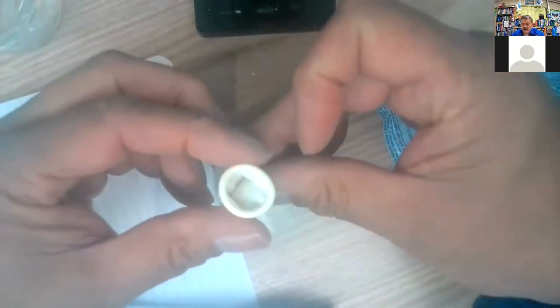Got that thing started, air's out. Try to pour in tablet number 1. Open up the last envelope and get the rest of that in there. Okay, that's working pretty well.